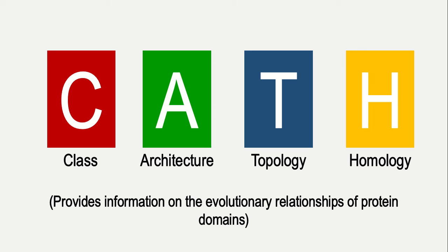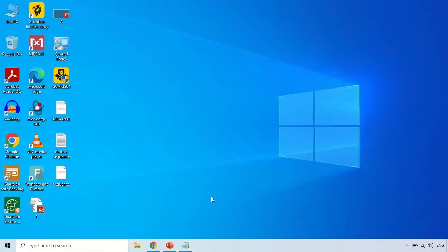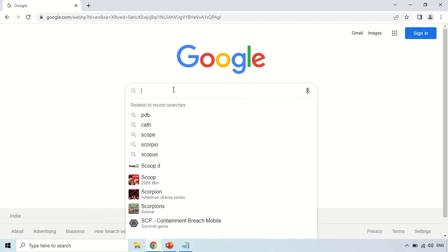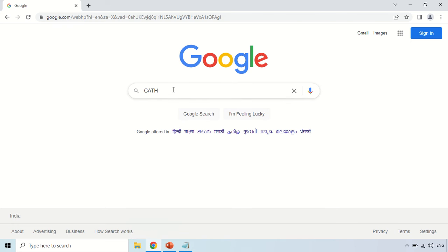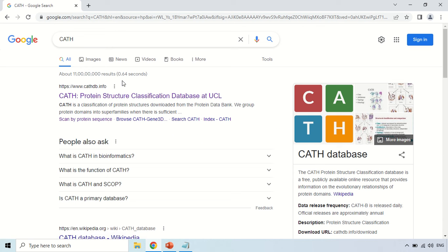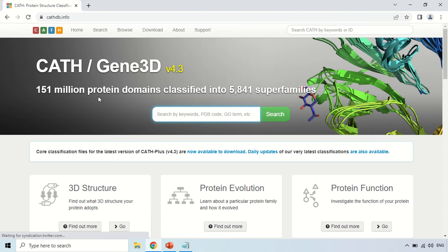This database provides information on the evolutionary relationship of protein domains. To use CATH and predict domains in your protein, just open your browser and search for CATH. The first website that appears is cathdb.info — that is the main website, so just click there. This is the home page of the CATH database.